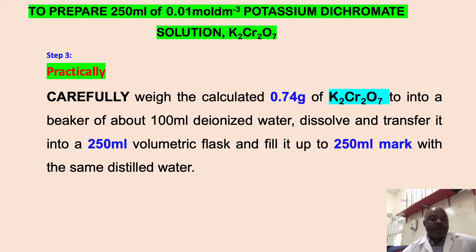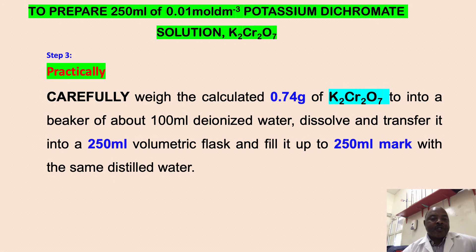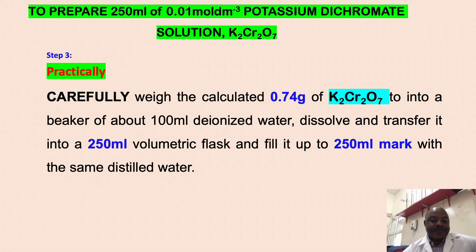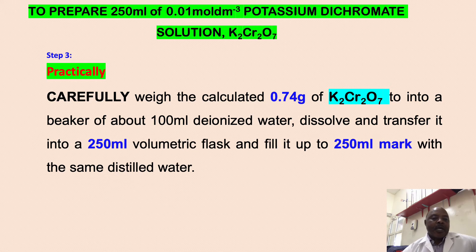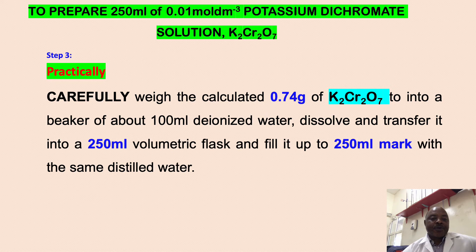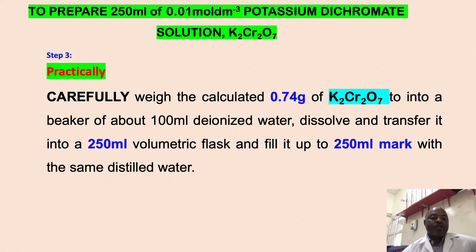Now, you will carefully weigh using the balance 0.74 g of potassium dichromate. Transfer it into a beaker of about 100 ml deionized water. Using the glass rod, dissolve it properly and transfer it into a 250 ml volumetric flask.